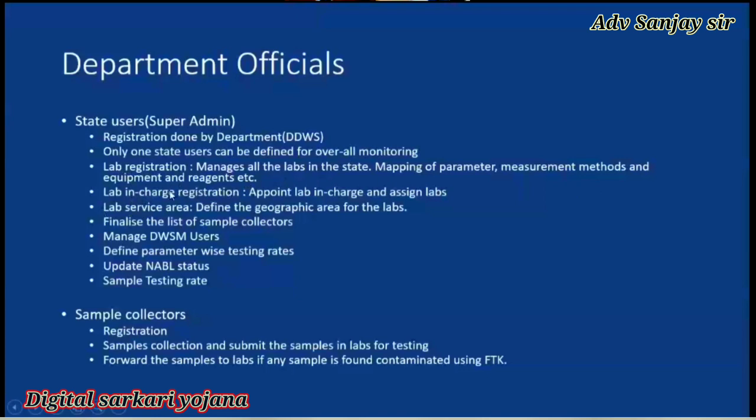Then lab in charge registration. This is another important role of the super admin. He has to appoint the lab in charge and assign labs, and anytime he can deactivate and reactivate these lab in charge, or if someone got transferred, he can change the lab in charge also.